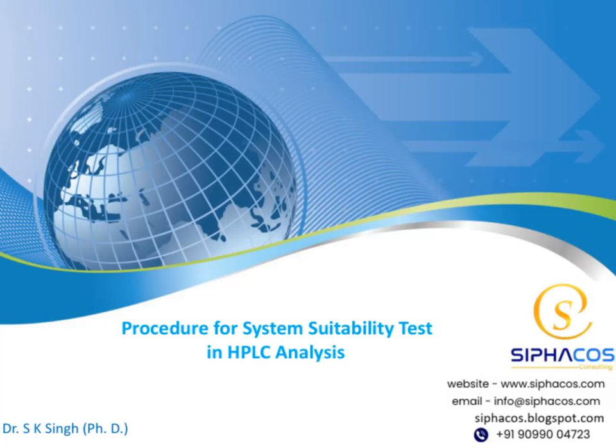I am pleased to have the opportunity to present today on a very important topic. The title of our presentation is Procedure for System Suitability Test in HPLC Analysis. Today, we will explore the key steps and considerations involved in ensuring our HPLC systems are suitable for accurate and reliable analysis. We'll cover the fundamental procedures, best practices, and some practical tips to help you implement this effectively in your work. Let's get started and dive into the details.